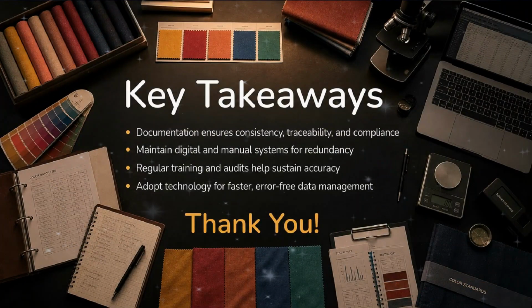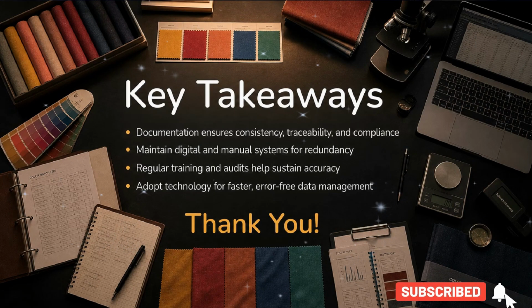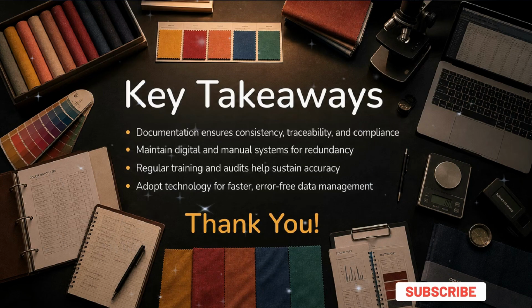In summary, documentation is key to consistency, traceability, and compliance. Maintain both digital and manual systems for redundancy. Invest in regular training, and adopt modern technology to streamline your data management.